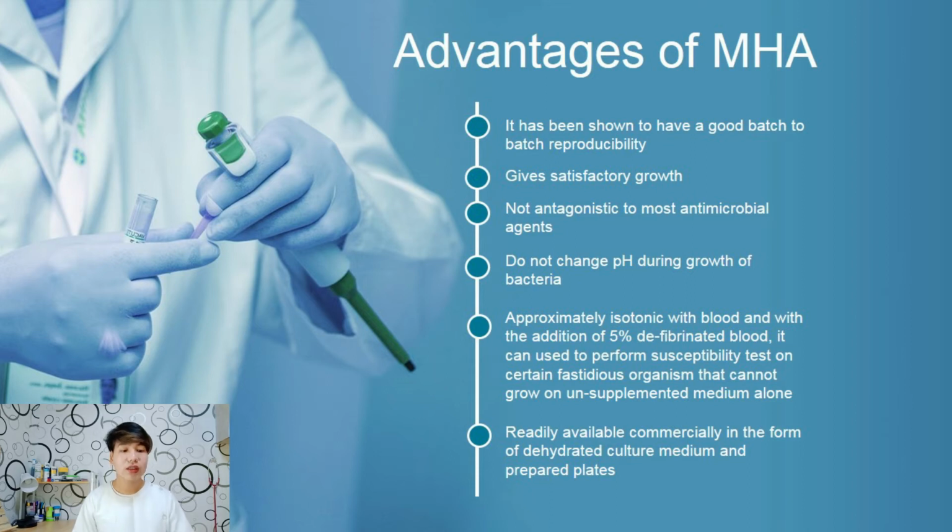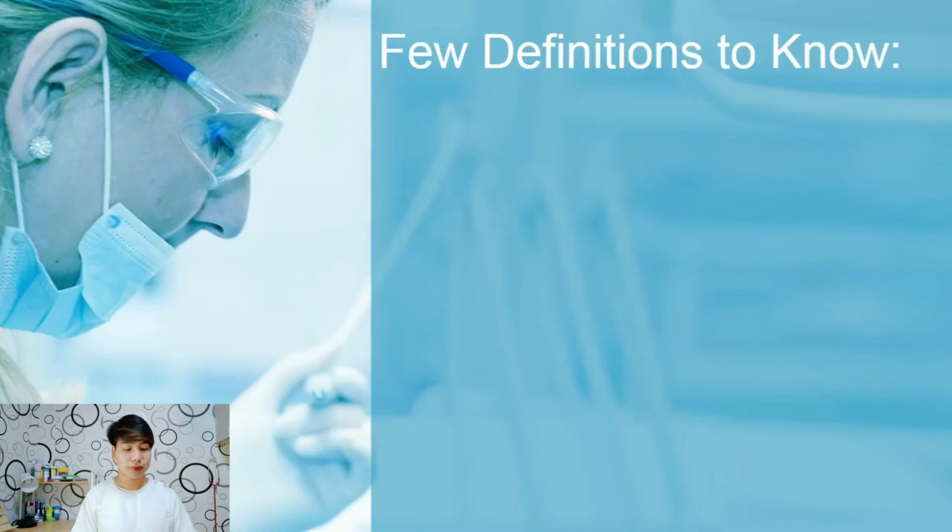Last and most important advantage is that it is readily commercially available in the form of dehydrated culture medium and prepared plates.